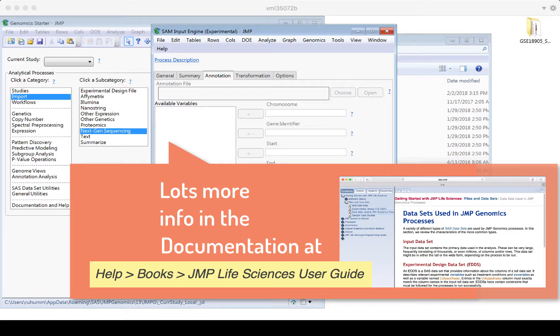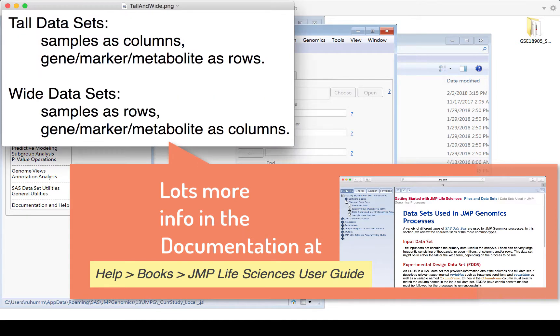One last note about the data files for JMP Genomics. Some menus are going to refer to tall or wide data sets. Tall data sets will have the samples as the columns and that molecular entity that you're measuring as the rows. Wide data sets will be the opposite.